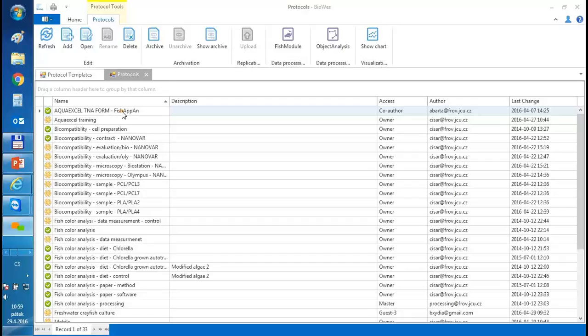If you decide to use the AquaExcel repository for your experiments, then feel free to use your already created account. Or if someone sees that the repository is useful and would like to have the repository directly in the lab, it is not a problem to contact us, and we can try to prepare the repository for your lab, so it will be fully under your control.